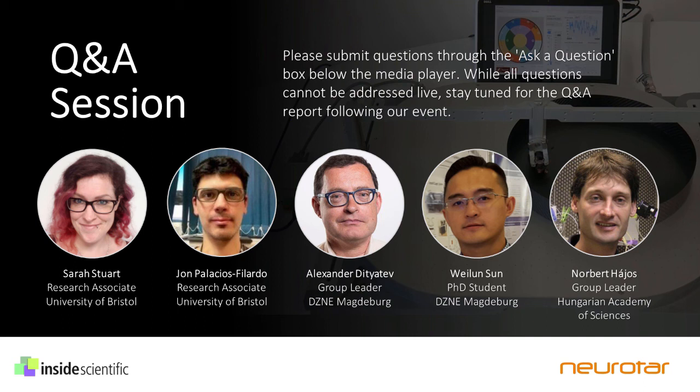Oh, okay, perfect. And so this next question is for Jon. How easily can you expect to find CA1 pyramidal neurons with place cell activity?